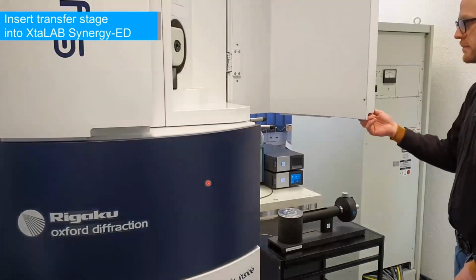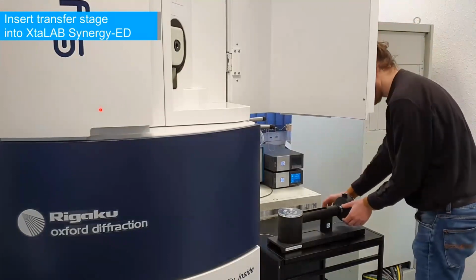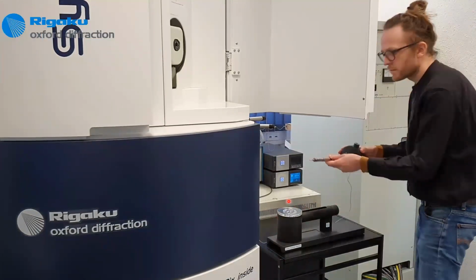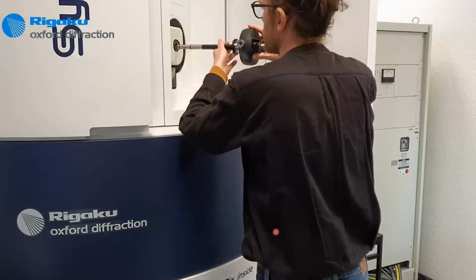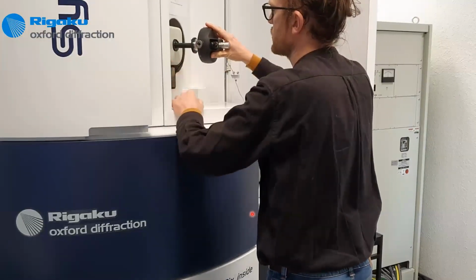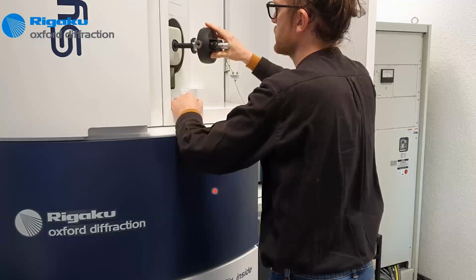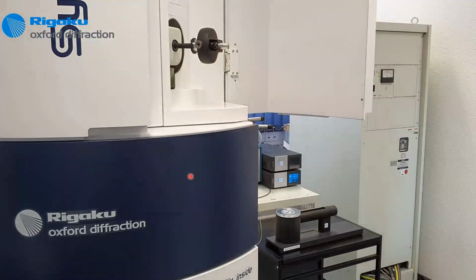So this is our laboratory here near Frankfurt. So, Synergy-ED for real. And what I'm doing now is taking this holder from this little black transfer station, which has this small dewar here too, where you can load your sample into the holder under cryogenic conditions. It is now inserted into a sample airlock system, so not yet fully into the diffractometer, but into a pumping airlock, which within a minute or two reduces the pressure by almost 10 orders of magnitude around the sample tip.